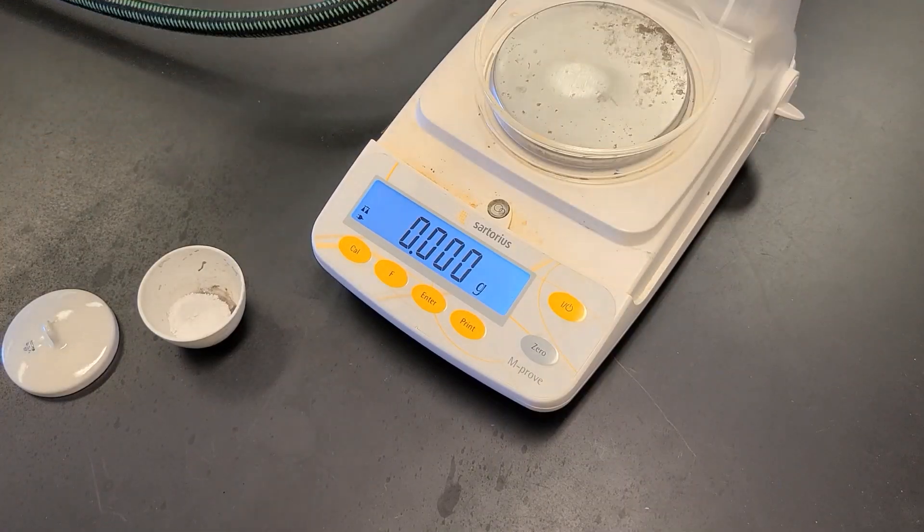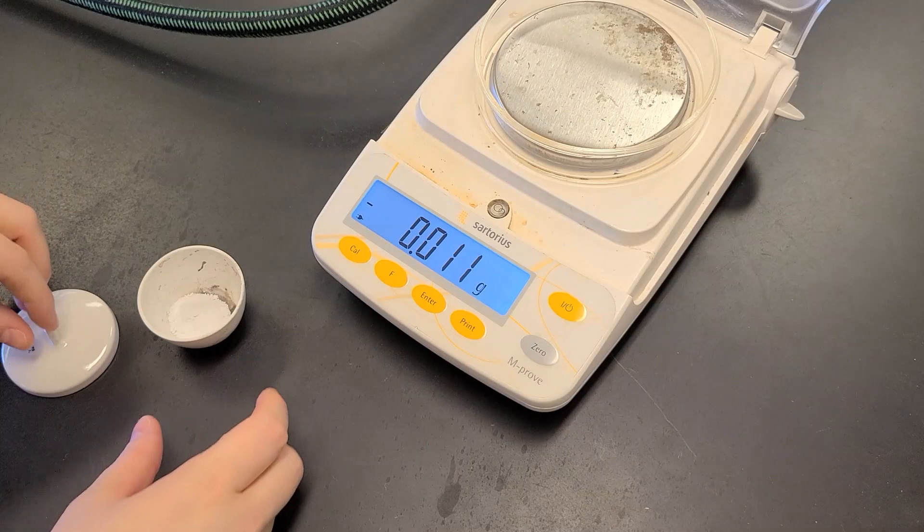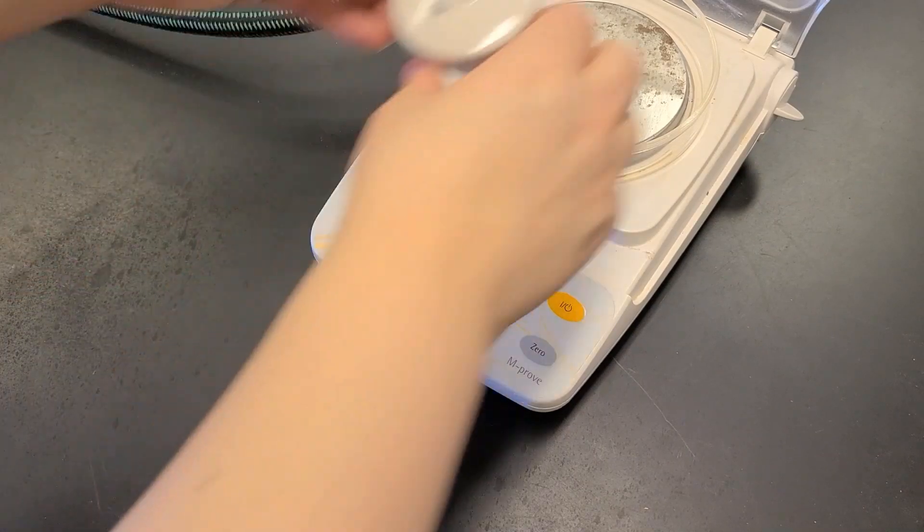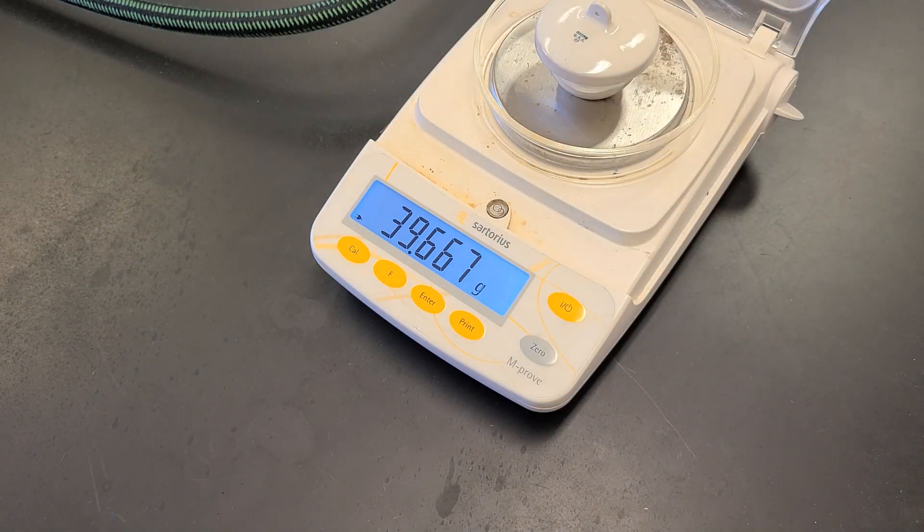This is allowed to cool completely again, and we measured the mass a second time. Based on this mass, we've reached constant mass. It matches our previous measurement, so we're done.